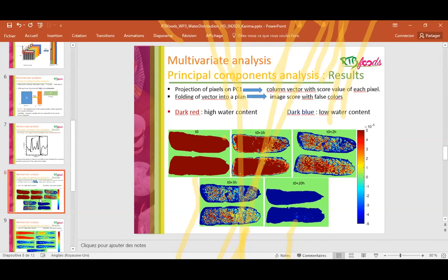A question from Julien. If you take an image, you can use these samples for other analysis. For example, in laboratory destructive analysis, we can reuse your samples, and here you can use them for the other analysis.